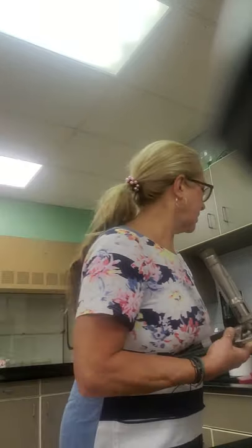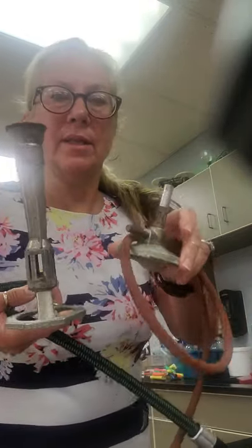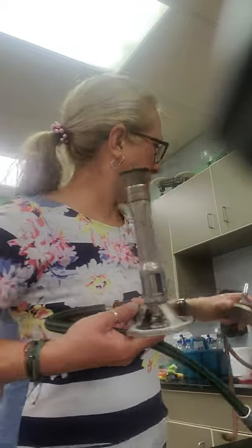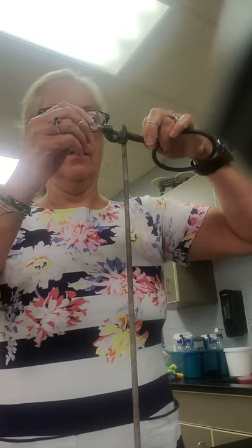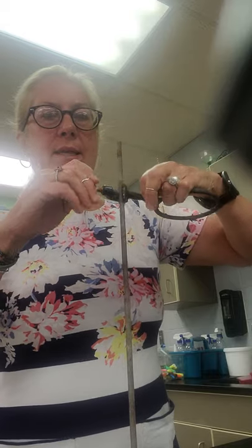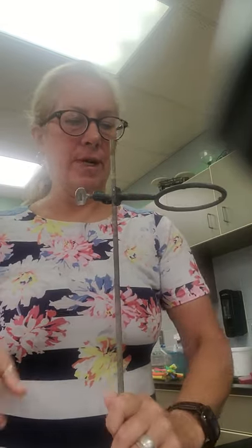Number eight: the burners we use will be Meeker burners. The difference between a Meeker and a Bunsen — this is a Bunsen, this is a Meeker.